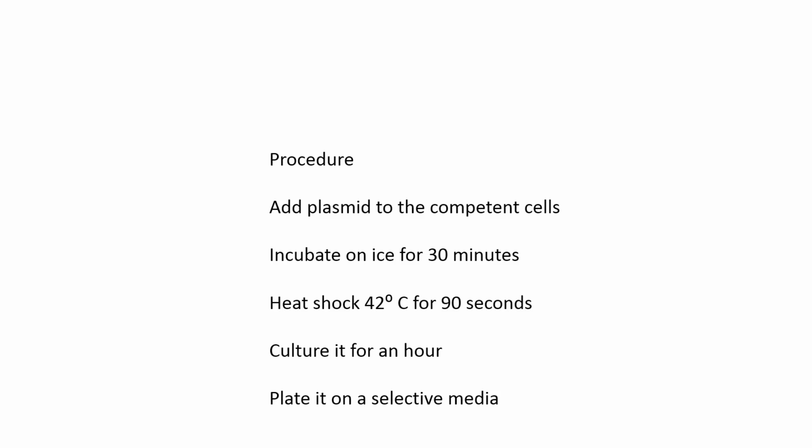So we incubate the plasmid and competent cells on ice for 30 minutes and then briefly give a heat shock, incubate the culture to grow, and then we plate it on a selection media.